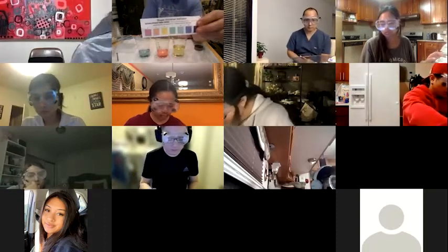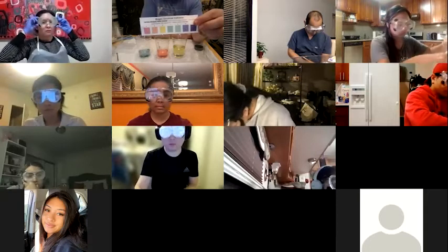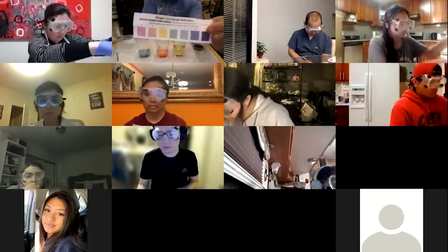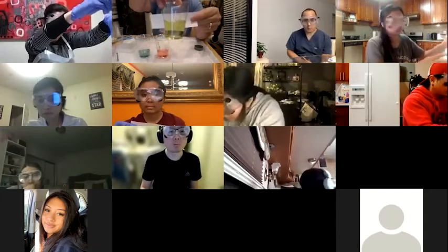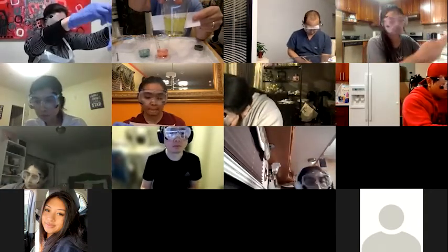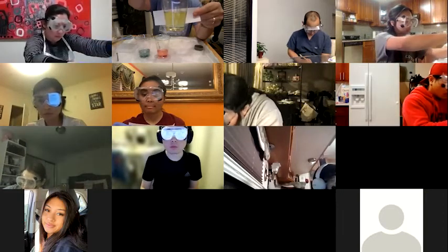So based on the color chart, you can see that neutral, around pH 7, gives you a green color. I guess you could call that green, kind of. Depending on the background, it looks either yellow or, I guess, green actually.